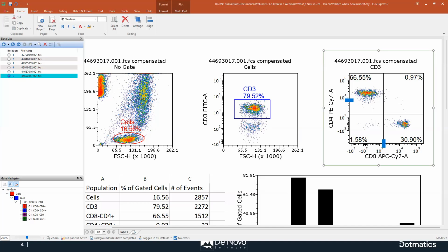Basically, events that are not visible on the plot because they are somehow behind the axis. How can that happen? Maybe you changed the minimum and the maximum, or you changed the below zero parameter, as we did, in a way that ends up with events behind the axis.